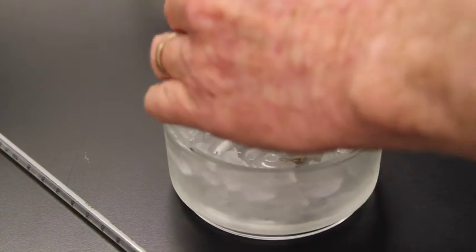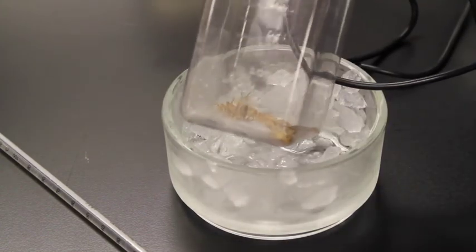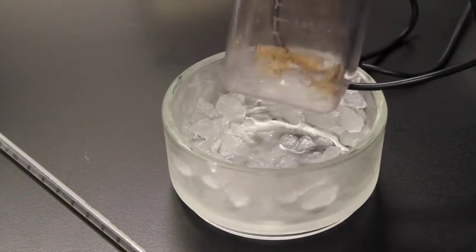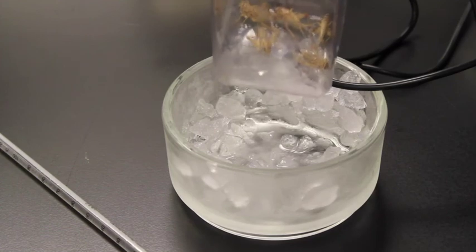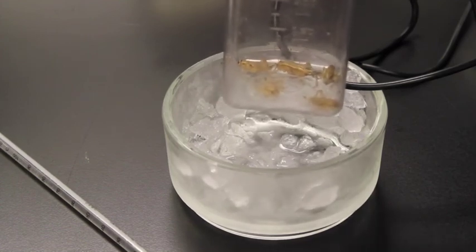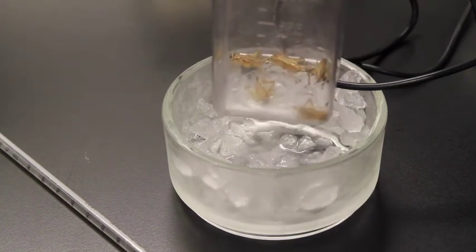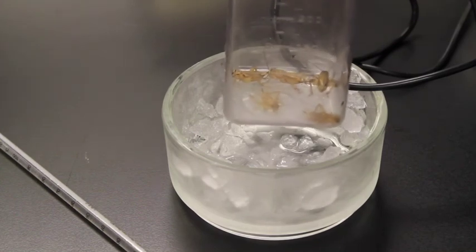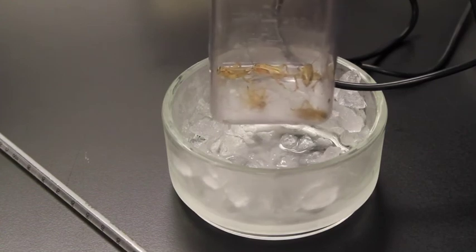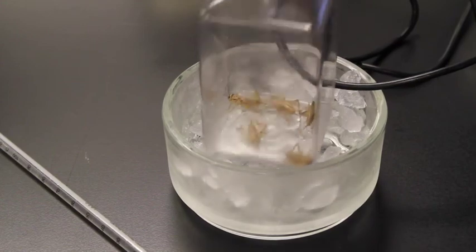And so we can open this up, right? Take our crickets off, and we can look at our crickets here. So our crickets aren't moving very much at all. They're pretty much kind of there. They're not really dead, they're just in a torpor. And so, yeah, it's kind of important to realize that this isn't really cruel to the crickets, because these crickets are different than people. So think about our hypothesis and think about what's going on physiologically with these guys that allows them to be put on ice and to cool down like this, and how that would be different than people.